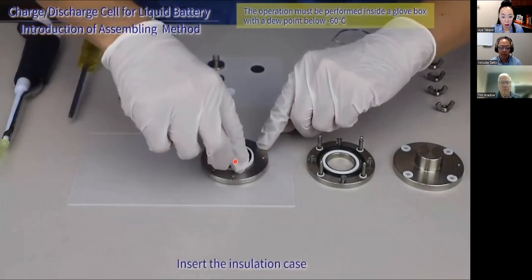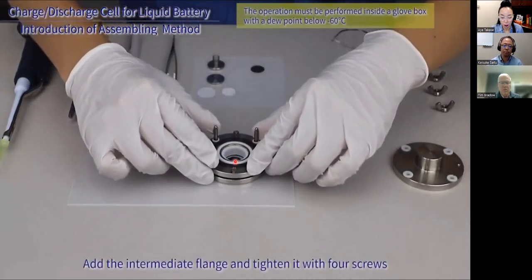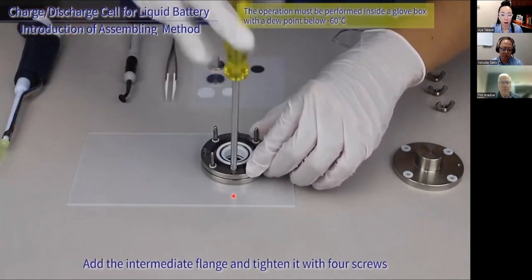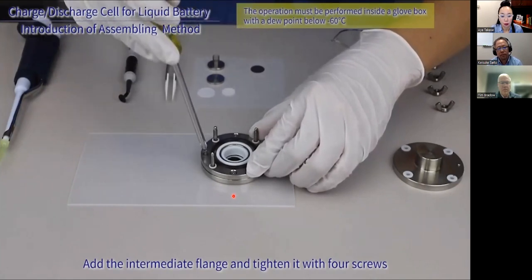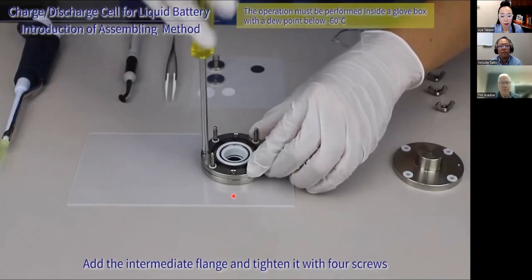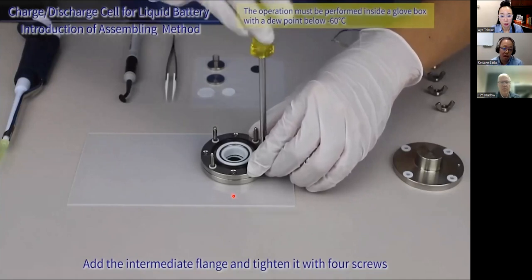Then we put our insulator on top of it. Then we place the flange. For airtightness, we have O-rings everywhere, so this flange must be fixed by screws like this. For video purposes only, we are doing this preparation outside of the glove box, but as mentioned in the top right corner, normally this is done in the glove box.